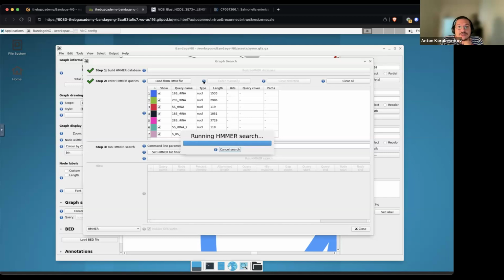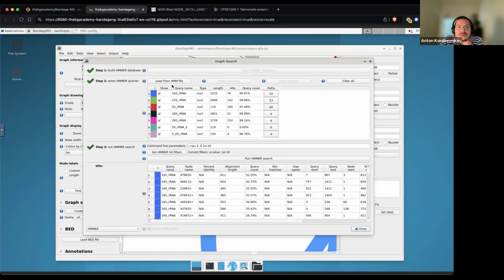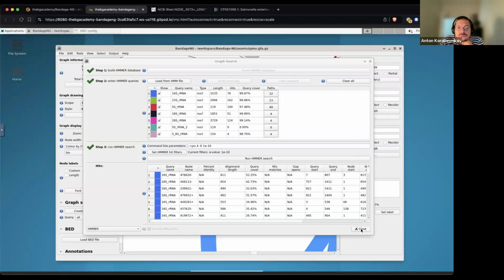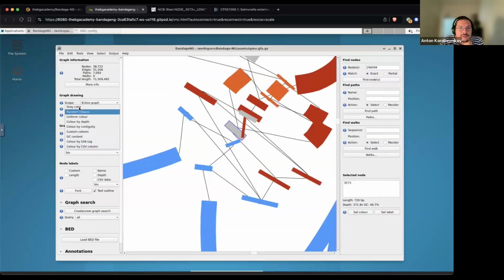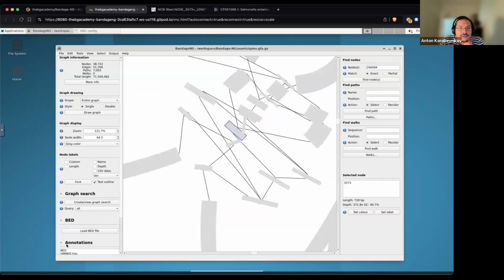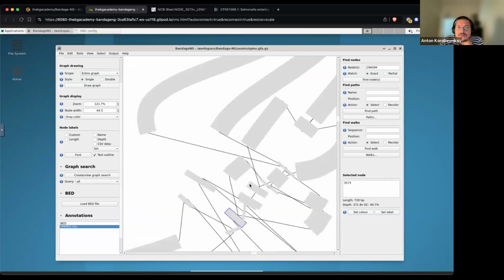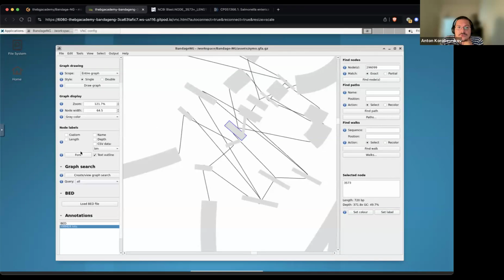Another thing, if you try that web BLAST search, there is a limit, so we cannot. Oh, so we finished. Right, so I think we have pretty decent results here. We have multiple 16S, multiple 23S hits. Interesting. So why don't we see anything here?